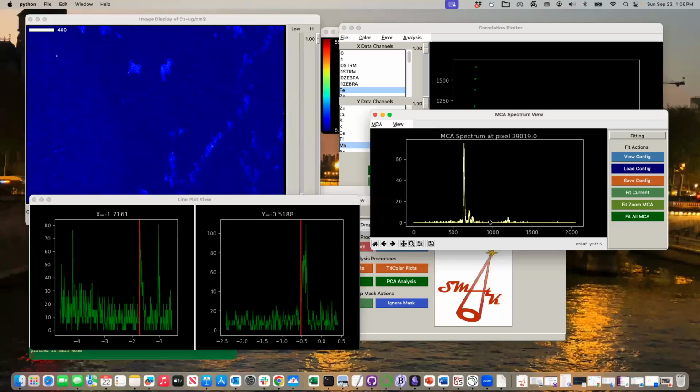Now 1 pixel is great, but again, these are typically at maybe we're clicking at 10 milliseconds, maybe 50 if we're going really, really slow. And that's what a really slow, really fast data collection might look like. So we can get single points that way.